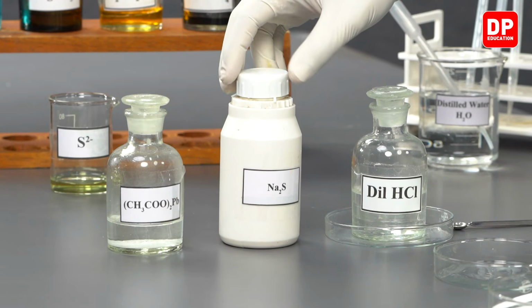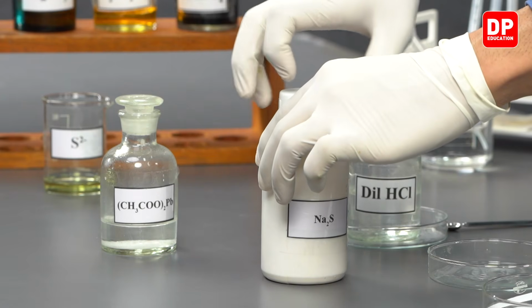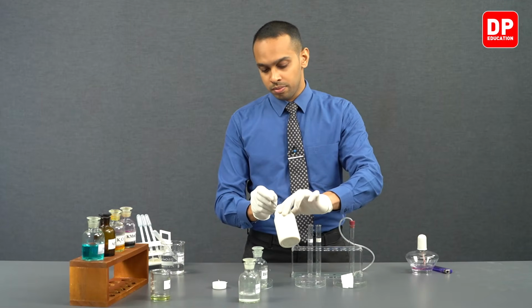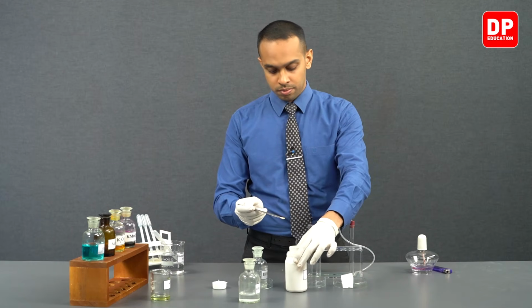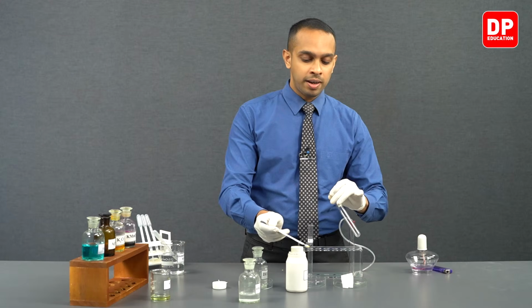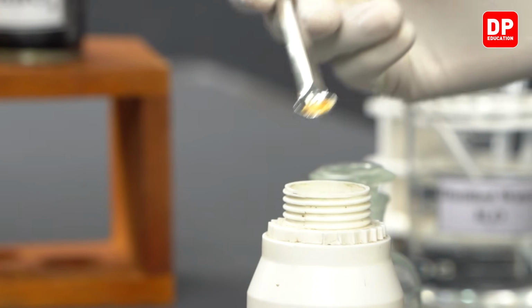Now let's take our sodium sulfide. You can see sodium sulfide is a yellow-orange color solid.